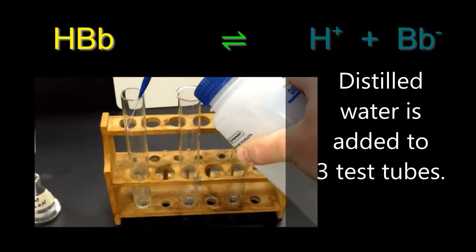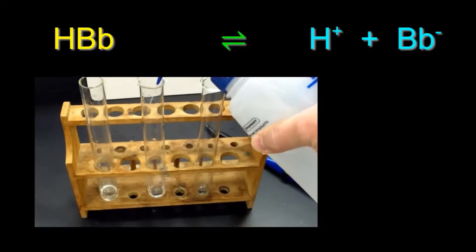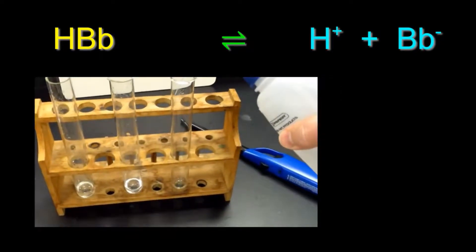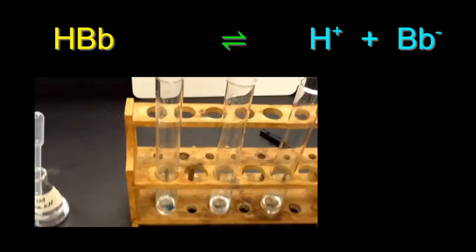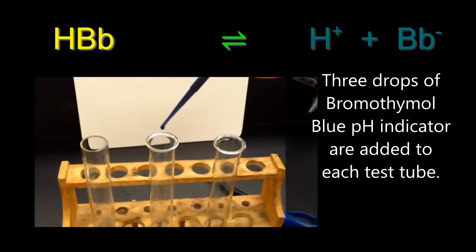The experiment is started by adding water to three separate test tubes. We see the water being added in here. Our next step is to add three drops of bromothymol blue pH indicator to each test tube.